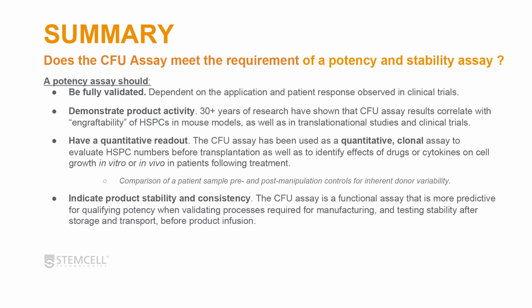And it's one that the regulatory bodies really ask about when they go into the cord blood banks. How have you validated this process? Show me that you have actually used the CFU assay at least at some point to validate those processes, because it's such a powerful assay and it's been proven over many tens of years that it correlates with the engraftment assay. The other thing a potency assay should have is a quantitative readout.